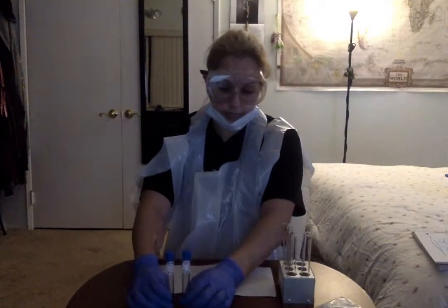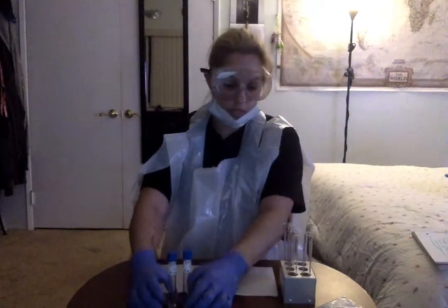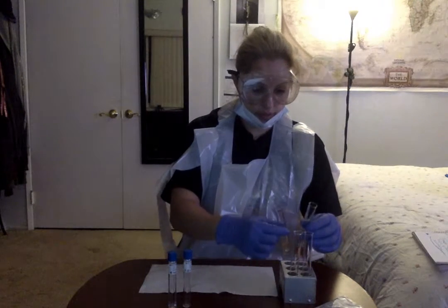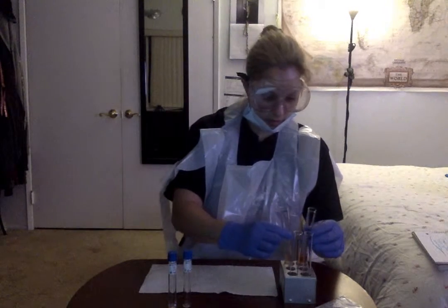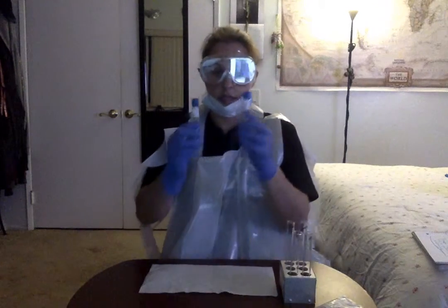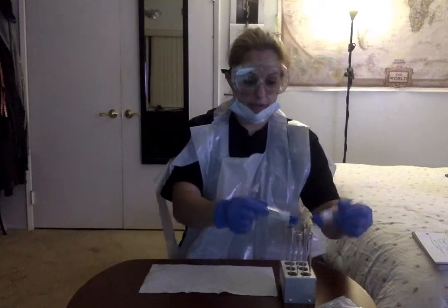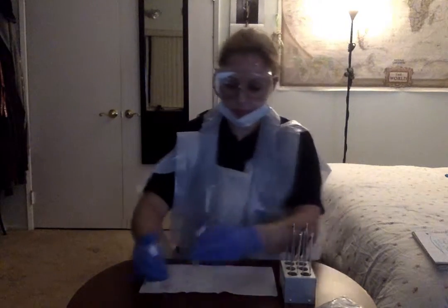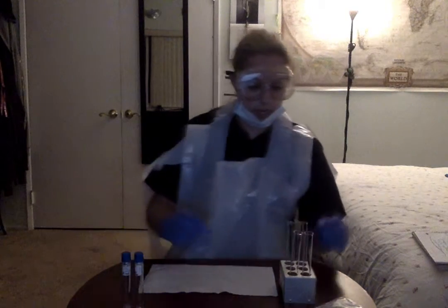Once I had these done, I took 4 test tubes. And then I divided those broths. Let me not mix these here. Okay. I divided these broths that had been incubated half and half into these 2 tubes. So it gave me a total of 4. So basically I divided these into 2. That's why I got those. Okay. And with that, the first part was the methyl red part.